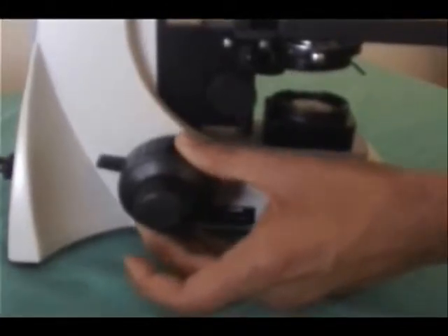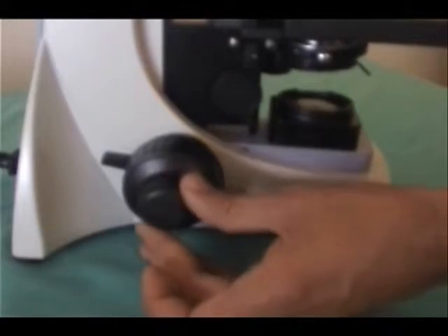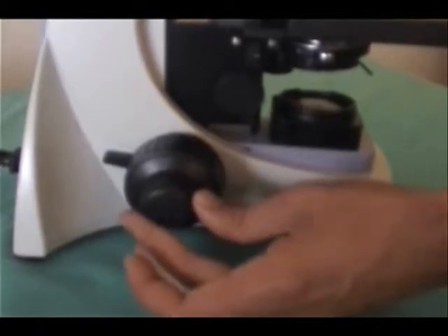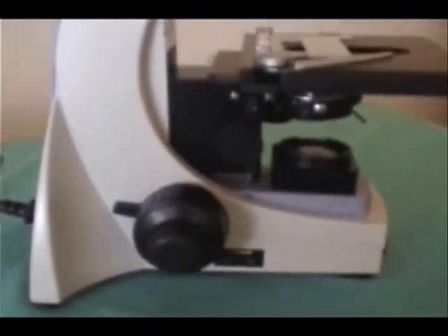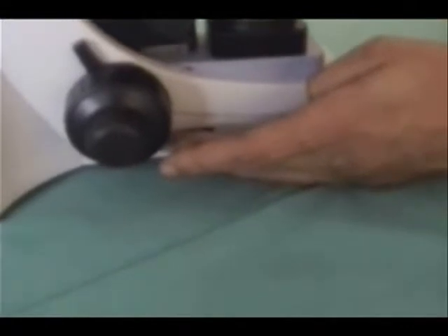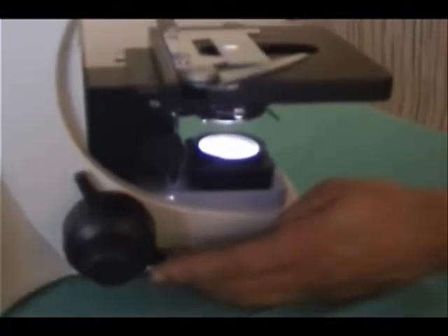Now, this is a coarse adjustment. This will allow you to move the specimen up and down in large intervals or the fine adjustment, which allows you to move the specimen up to 0.002 millimeters. Those are the intervals. And this locks into place. So when you have what you want, you can lock it in and it's not going to move. As we saw earlier, the light is actually adjustable and it's a halogen bulb. So you can adjust the brightness to fit whatever you're looking for.